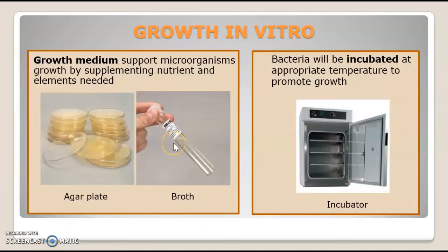Now we look at the apparatus or materials required in growing bacteria or any other microorganism in most microbiology laboratories. The first material required is the growth medium.